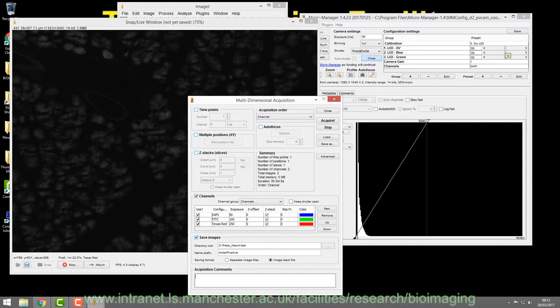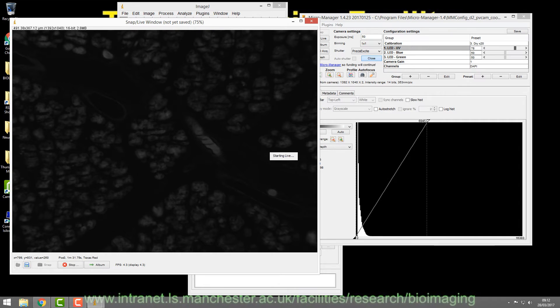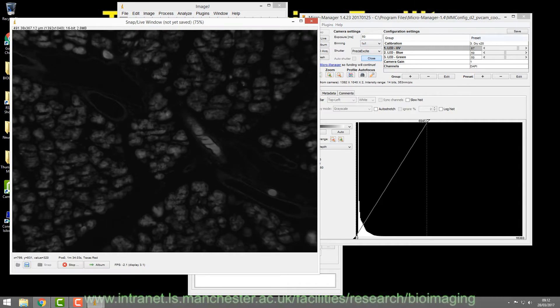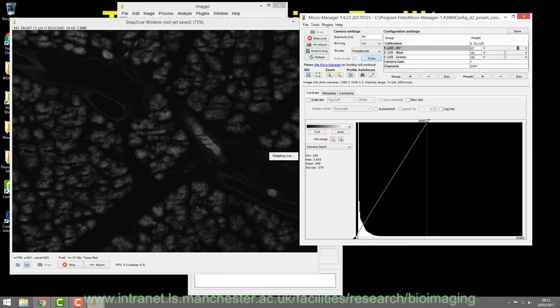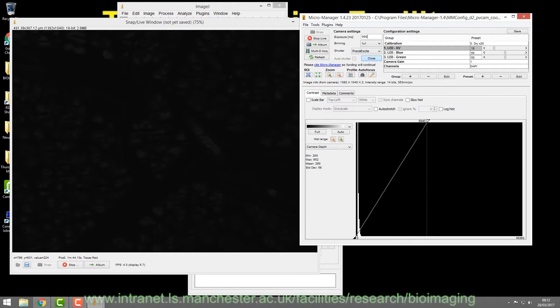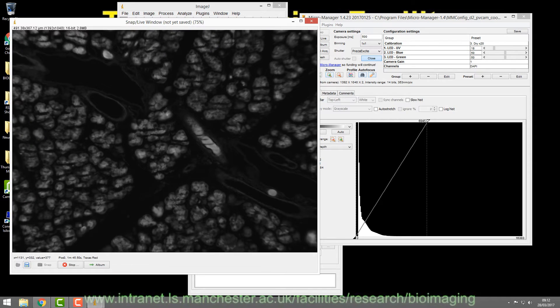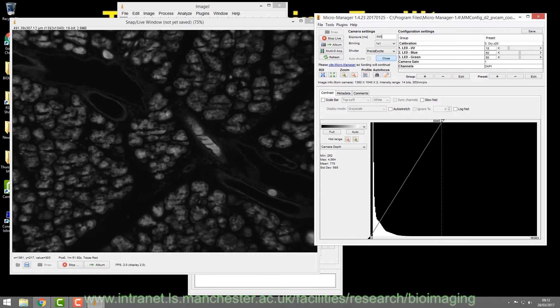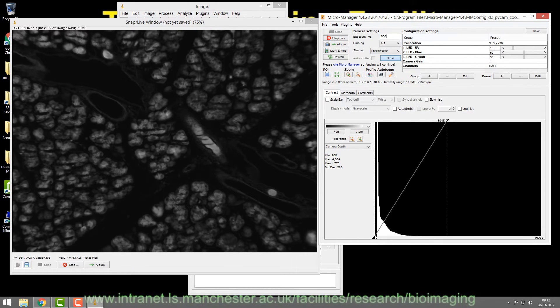You can also change the intensity of the LEDs for each channel — it's LEDs now, not mercury bulbs. You can increase LED intensity to keep a short exposure with high intensity, or do the reverse. If your sample is bleaching quickly, you can drop the LED intensity and increase the exposure time.